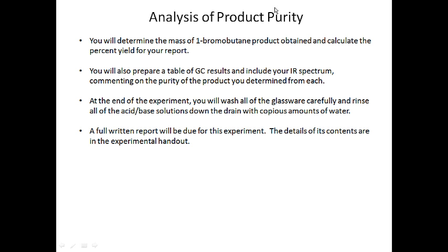At the end of the experiment, you're going to wash all the glassware carefully, because there's some concentrated sulfuric acid in it. So you're going to wash the glassware very carefully, and you're going to rinse any remaining acid-base solutions down the drain with copious amounts of water.